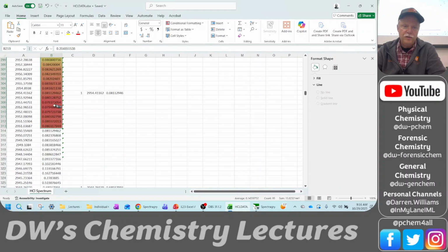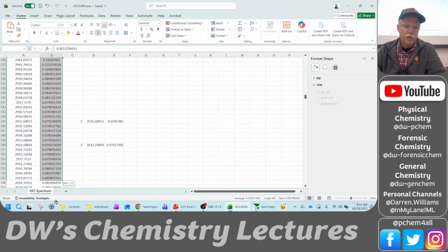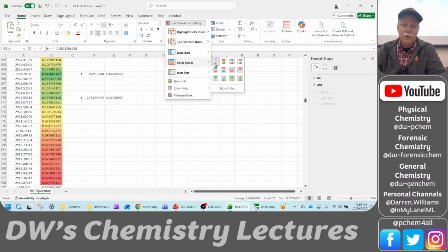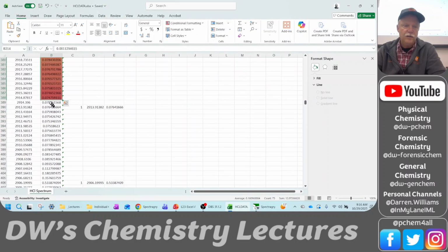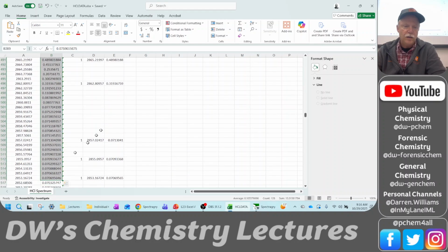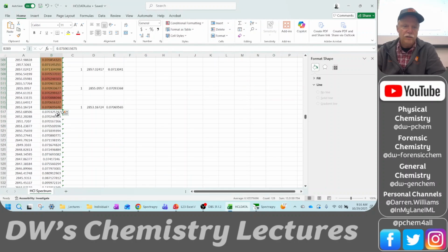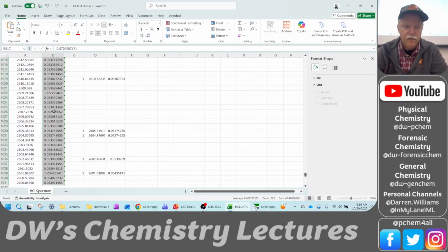So you see, I'm not being too picky with my color panels. I'm just going a little ways and doing the formatting just so that it breaks it up into different ranges of red to green. Okay, I'll just finish it out here because you get the idea, right?